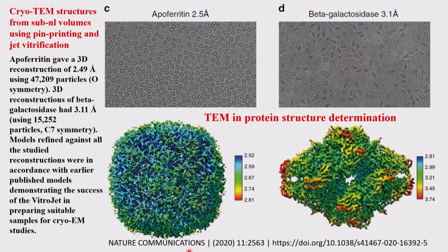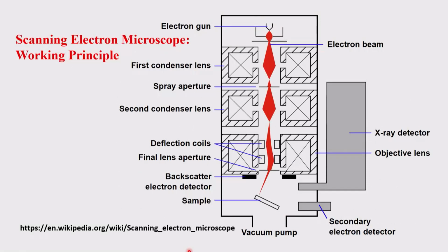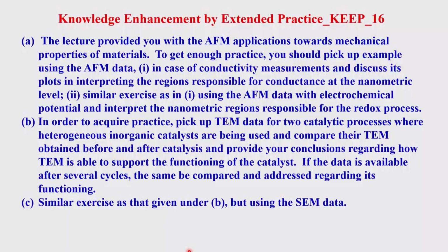You can also measure the structures of proteins, structures of viruses, the nature of virus particles, etc. And just in this class I talked to you about some examples of nanocomposites and nanoflowers. So I think in order to keep pace with the course, you need to do a certain level of practice, to make these things more familiar and understandable, and for knowledge acquisition by the candidate.